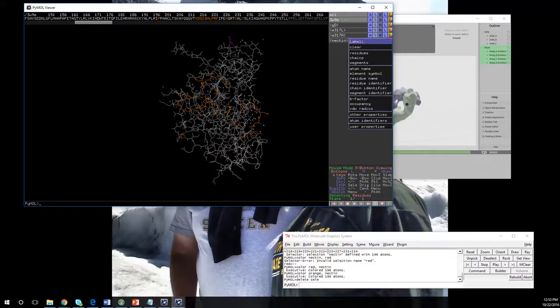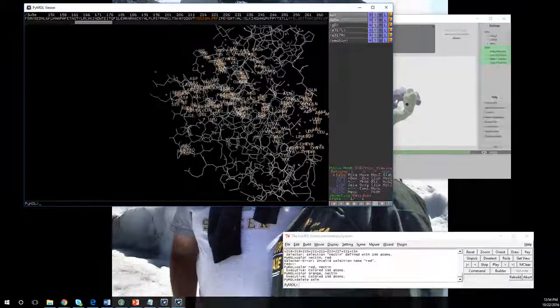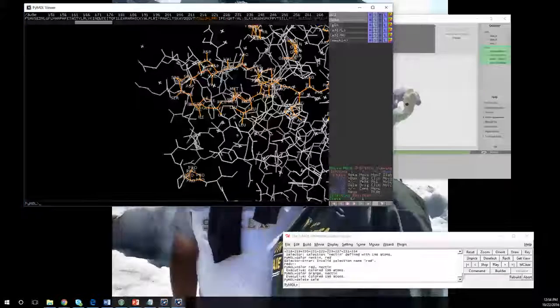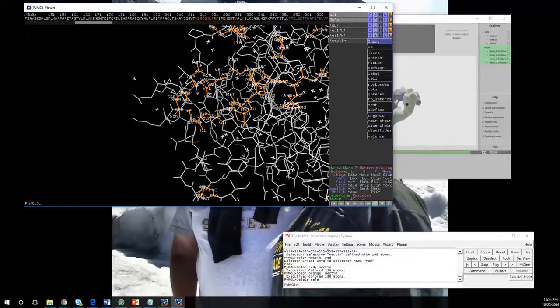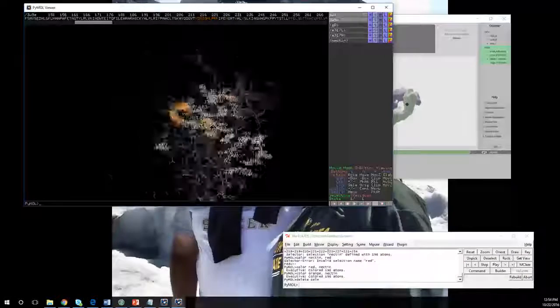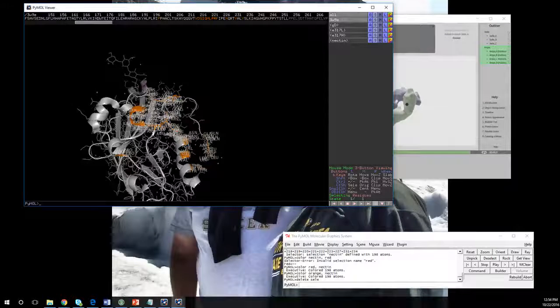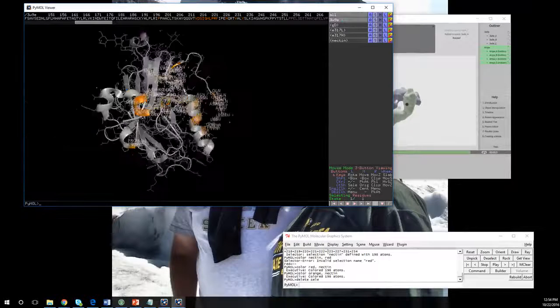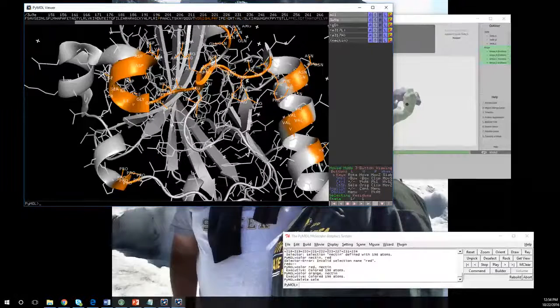If you look at the nectin, you can label the nectin right here by the residue name. Now I'm right clicking and dragging, and you can see that all of the residues are labeled. I can also go in here and show as a cartoon, so I can see the secondary structure of the nectin binding domain. If I want to look at the whole thing as a cartoon, now I can look at it, and if I zoom in, I can really effectively see what's going on.